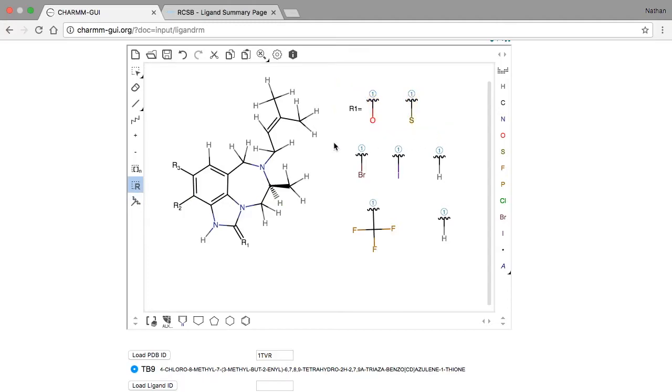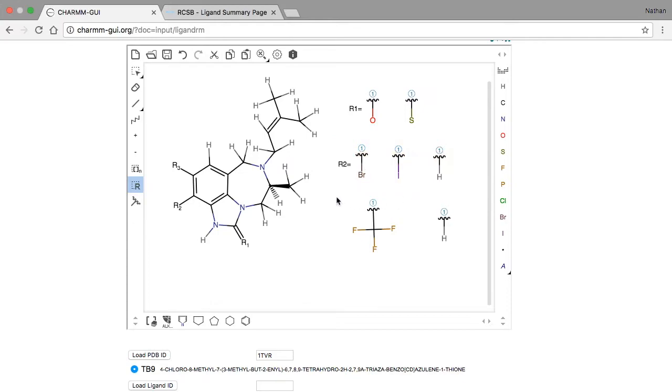For the second R group, we want to use either of these three options. And for the third R group, we want to use either of these two options.